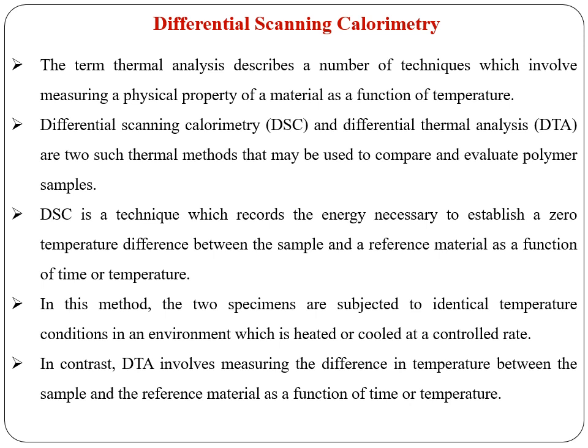DSC, that is differential scanning calorimetry, is a technique which records the energy necessary to establish a zero temperature difference between the sample and a reference material as a function of time or temperature.